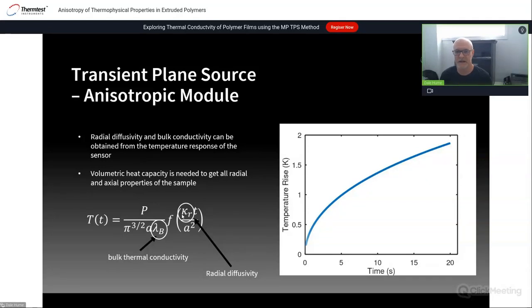There are some advantages to that over a DSC, and that is that it's measuring a larger sample, which can be advantageous if you're measuring heterogeneous material or materials that are constructed in such a way that you can't locally cut a sample out for a DSC, such as a battery, pouch, or cylinder.